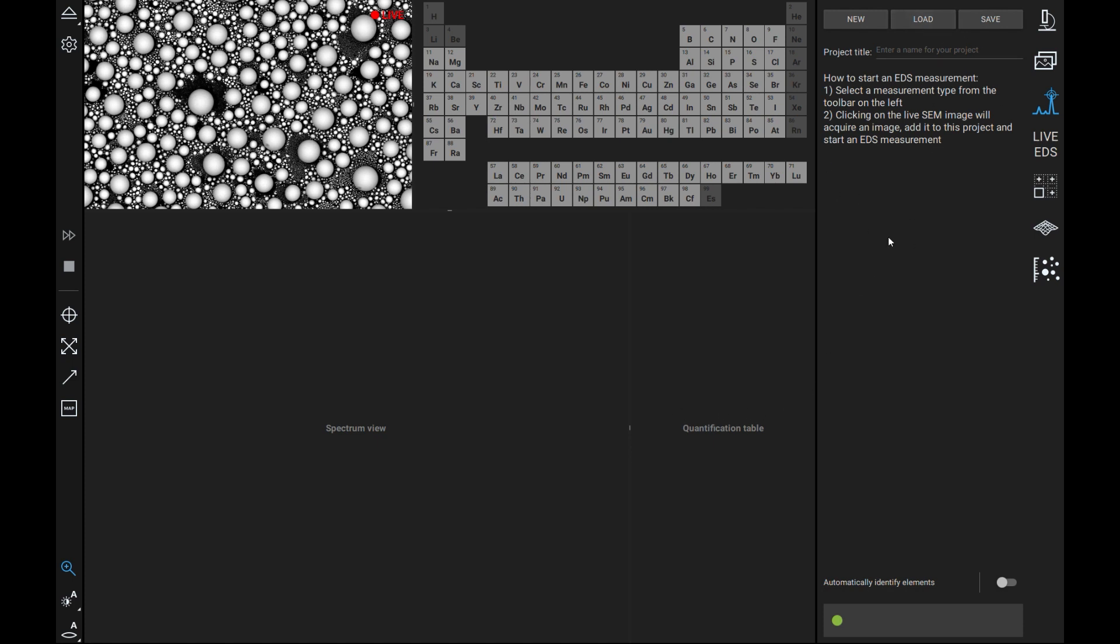There are four types of EDS analyses and these options are located on the left hand side of the screen. These are spot, region, line scan, and map analysis.